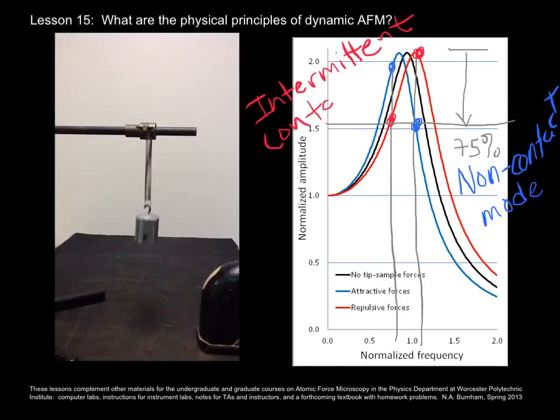So you might have heard these terms about AFM: non-contact mode and intermittent contact mode, abbreviated IC AFM and NC AFM.